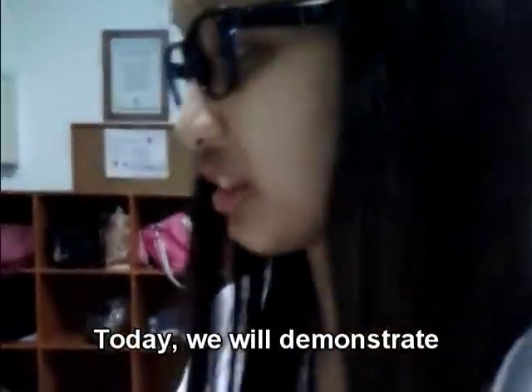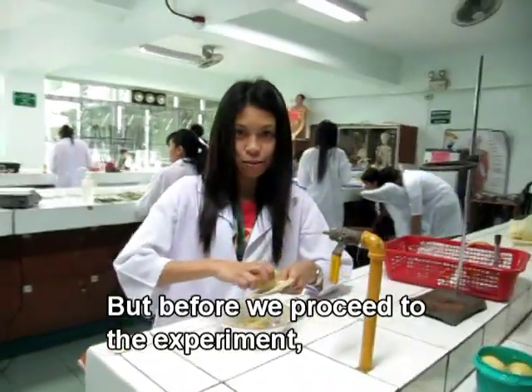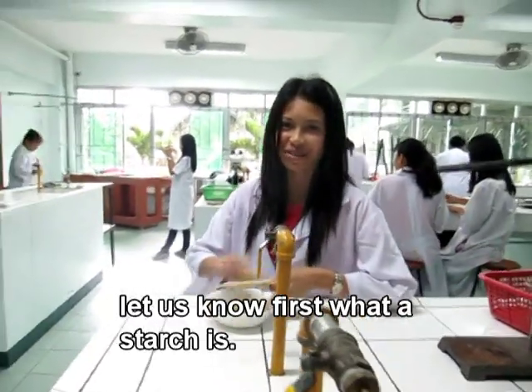Hello everyone! Today, we will demonstrate how to extract starch from a potato. But before I proceed to the experiment, let us know first what starch is.